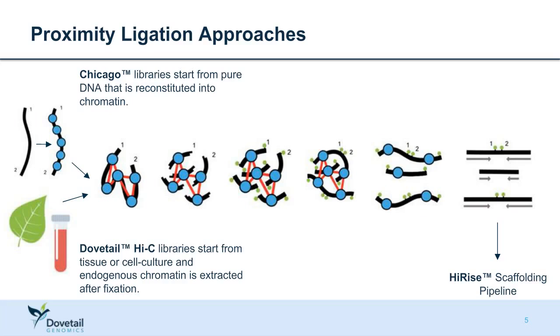Next, we actually use a restriction enzyme to cut out this DNA aggregate, and as a result of that, it causes sticky overhangs, which is very normal. And what you get out of this is that from a single long DNA fragment, now you have numerous fragments of DNA. And the good thing about the cross-linking is that because it was done before, it actually retains the proximity ligation information there before we do the next step.